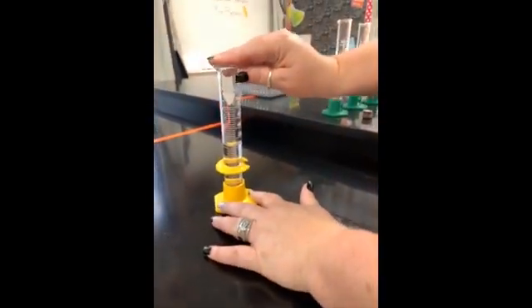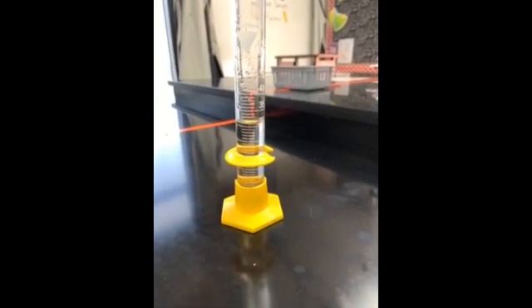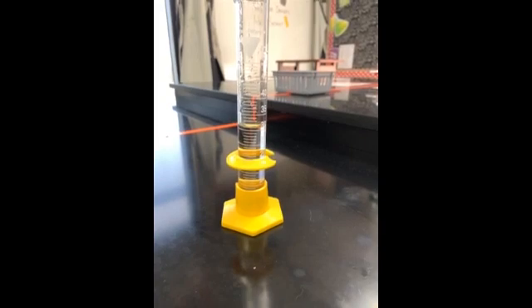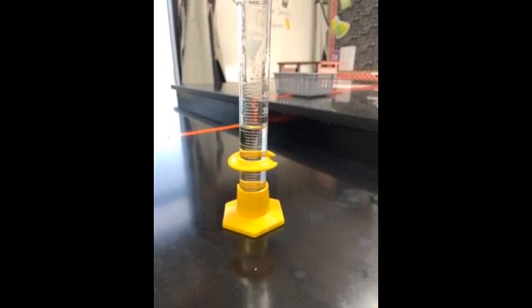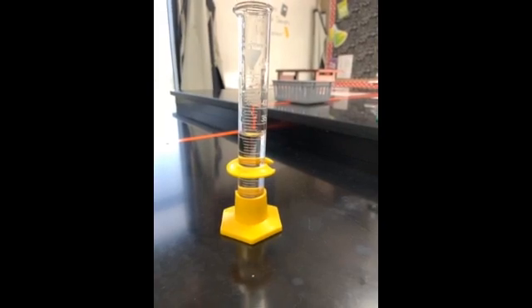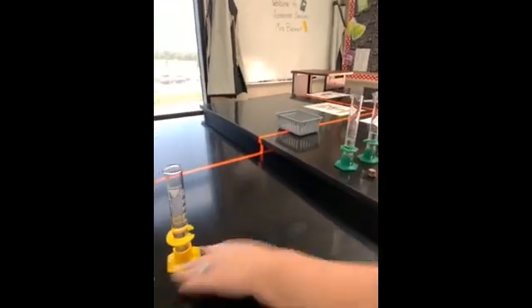Now the volume, cylinder's not quite vertical. Now the volume looks like it's just below the 30.2 mark, so I'm going to call it 30.19. Again, if you don't agree, you can use your own judgment, but obviously it's not going to be 45. Okay? So those are all 4 trials of the pre-82 pennies. All right, now let's do the post-82 pennies.